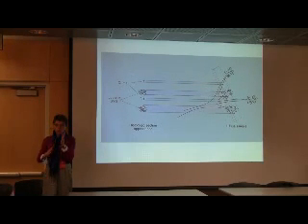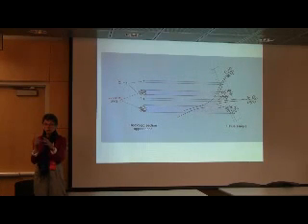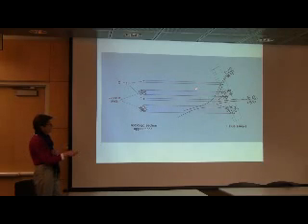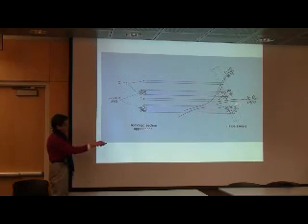We don't really know what the direction of the duct is, because we can't see the ducts, they're too small to see with the naked eye, so we just take a piece of this, sort of like a rectangle about 3-4 millimeters thick, and then you cut a very thin section from this, and what's going to be projected on the slide typically is a cluster here from the lobule that came from this end part of the system there.